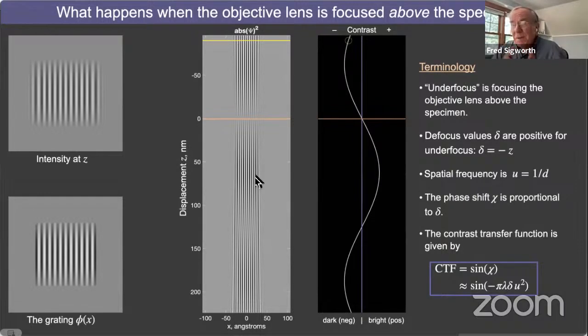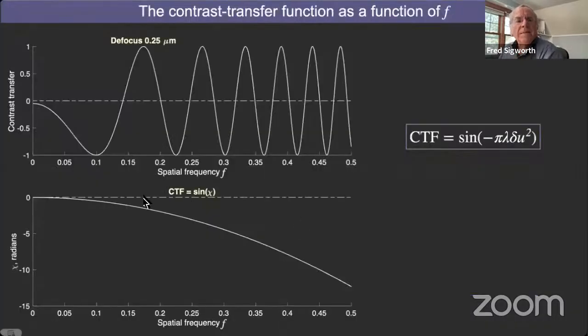And you know it's going to change, because as we change the grating periodicity, we're going to change the angles between those two diffracted waves, and so we're going to have a different periodicity of maxima and minima in the signal. And in fact, this is what it looks like. Here's chi. Chi varies as the spatial frequency squared. And so when we do the sine function of the spatial frequency squared, we get this accelerating sinusoidal variation.